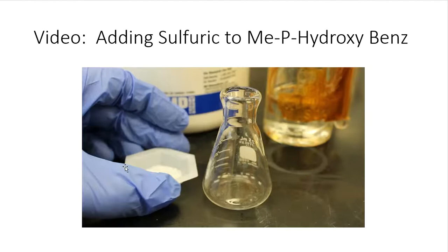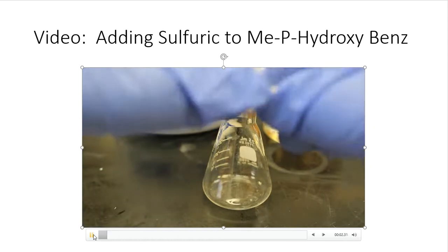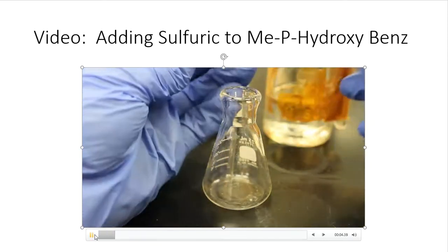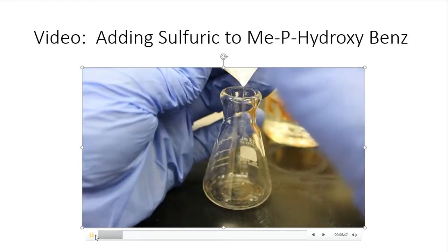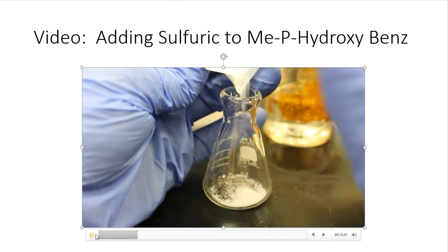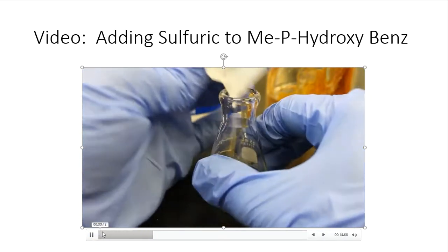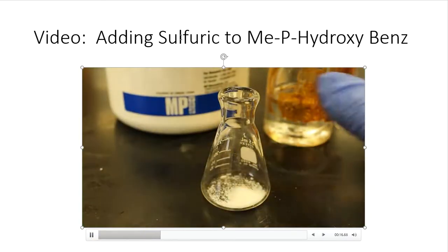And our second is adding sulfuric to our methyl p-hydroxybenzoate. So here is component number 2. Once again, fold the weigh boat, dump that stuff in there, and we're going to add 1 ml of sulfuric acid to the flask. Pay attention to the observations. It's probably going to ask for them on the data sheet.